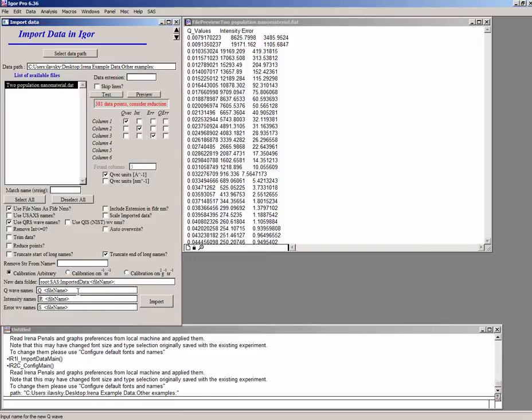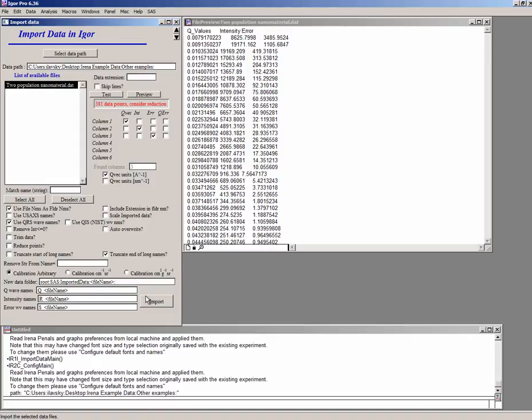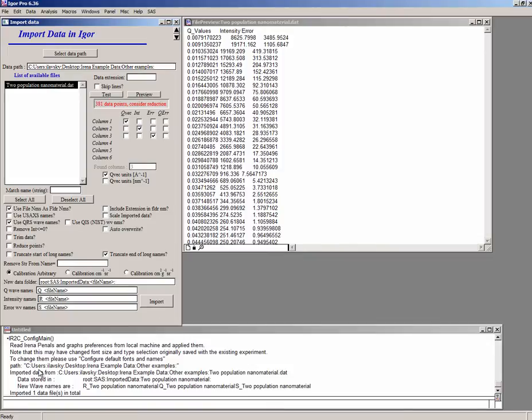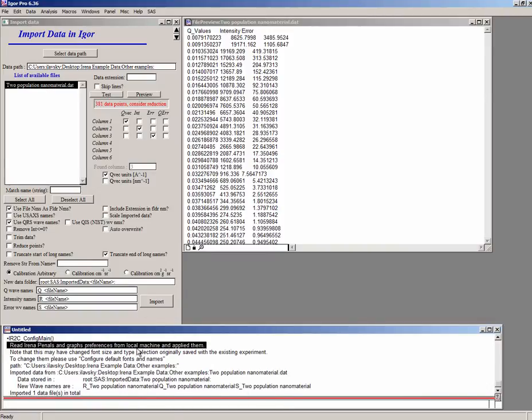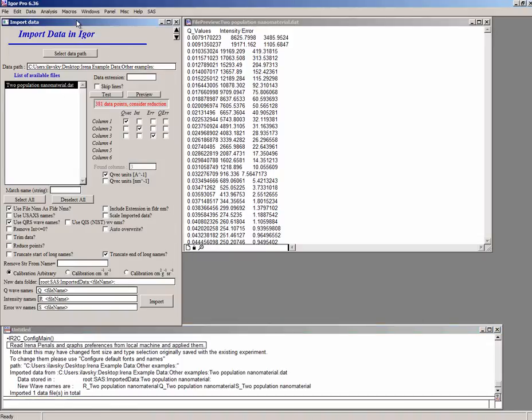Then we can simply import the data, look at them and decide if they are appropriate for fitting or not. So I'm going to just leave everything else as it is and say import. Down here in the history area, you will see that it has imported the data and it has created new waves, which is the Igor speak for columns of data. So now we have the data inside the Igor, what's called Igor experiment.